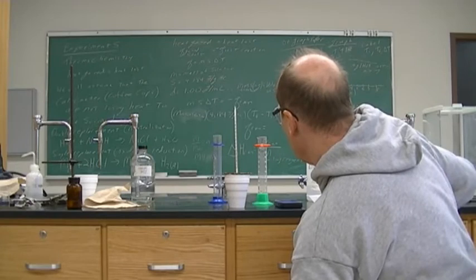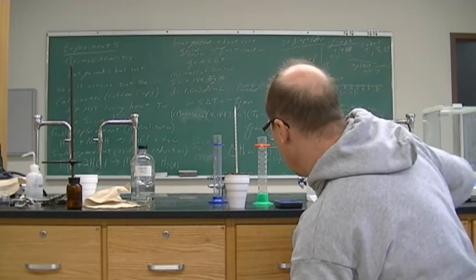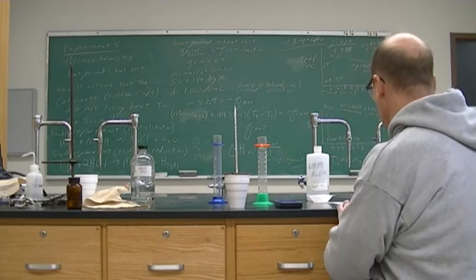All right, at the 9-minute mark, we are at 34.0, so now it is going back down.